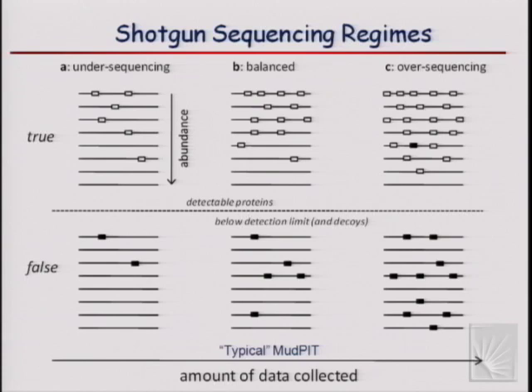So I think that APMS data, depending on the type of the data sets, can be anywhere between here and here. Certainly, if you have a few pull-down experiments, you'll be somewhere in this regime where you can obviously identify more proteins by taking completely unrelated baits and adding to the initial analysis, and the number of proteins will grow. But a lot of APMS data sets that I recently looked at are actually seriously in this regime, especially if you study a protein complex or a really local network with many interrelated baits. So they pretty much pull down the same set of interactors no matter what protein you use as a bait.